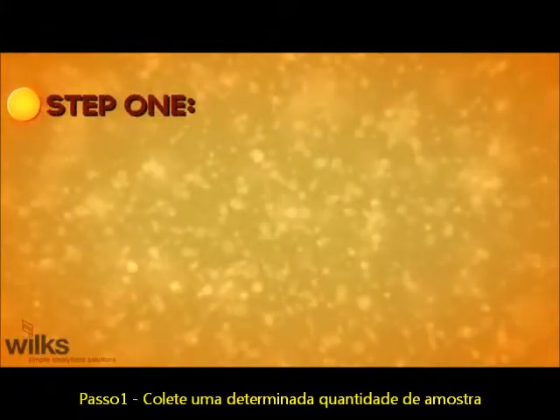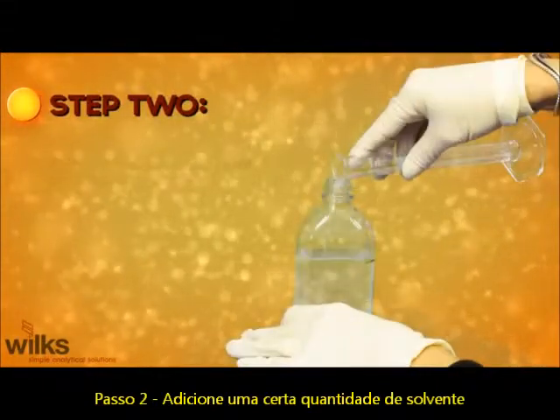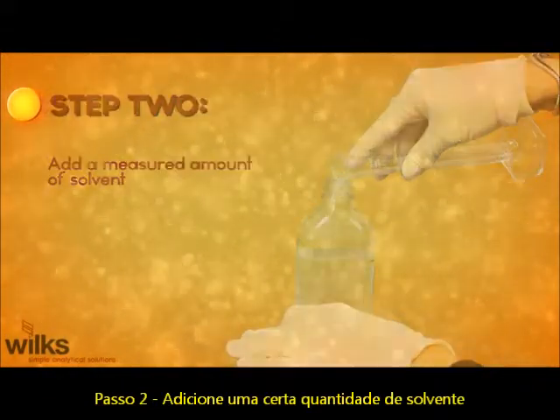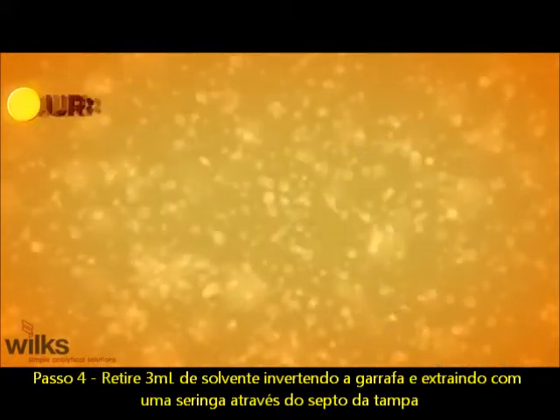Step 1: Collect a measured amount of sample. Step 2: Add a measured amount of solvent. Step 3: Shake for 2 minutes.